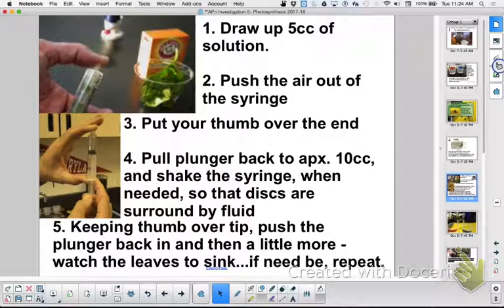Okay, then what I do is I go over to the cup that I got the solution out of, and I just put that water right back in there. Are you going to be short a few milliliters of water? Probably. It's okay. All right. Get your Starbucks stick that I put in there, if any get stuck in there, and use that to get them out. Now, as I'm looking, did all of them sink? Yeah. Booyah.